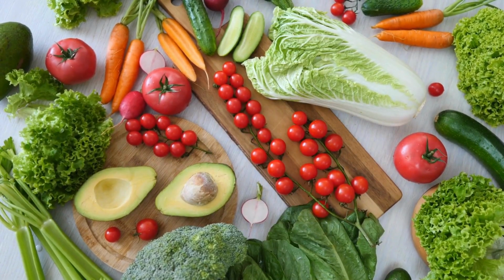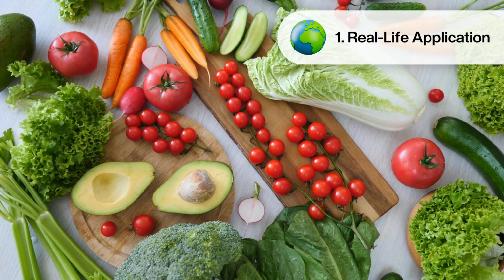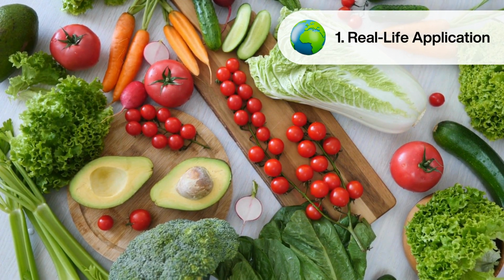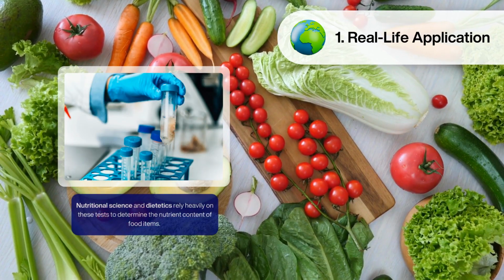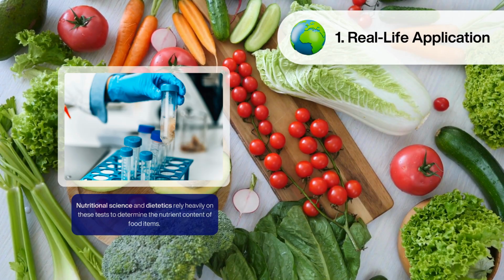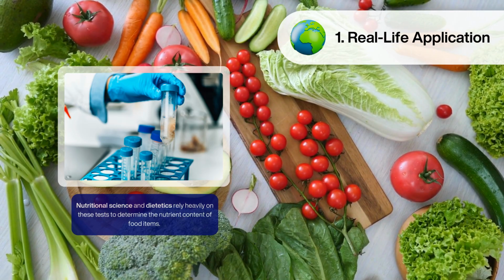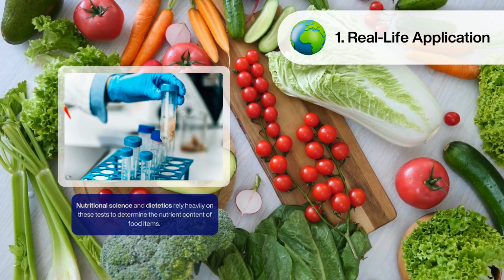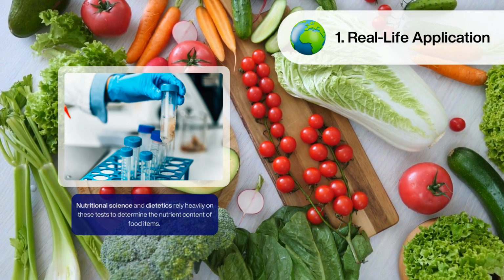Before outlining the practical, let's take a moment to consider its importance. Understanding how to test for carbohydrates, lipids, and proteins in food isn't just an academic exercise. It's used regularly in the world of nutritional science. Nutritional science and dietetics rely heavily on these tests to determine the nutrient content of food items. By engaging in this experiment, you get some hands-on experience with techniques that dietitians and food scientists use daily. This practical knowledge enriches your perspective on nutrition and will help you understand the ways in which we monitor the biochemical content of food, in order to understand its nutritional value.